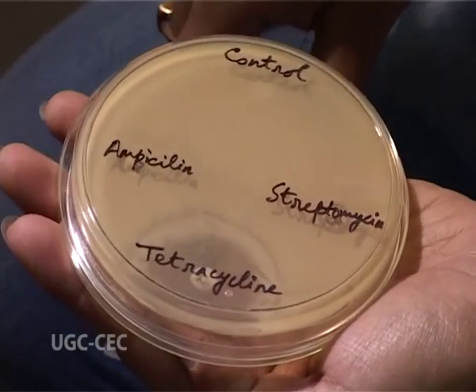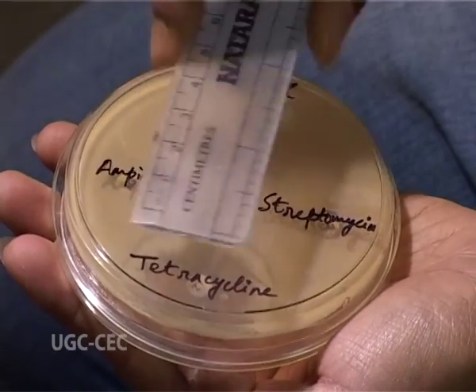On the basis of the inhibition zone, bacteria can be classified as susceptible, intermediate and resistant, following the famous Clinical and Laboratory Standards Institute method, or CLSI method. But there are certain precautions for this particular test or experiment. Number one, the antibiotic disc should be placed tightly on the petri plate. All the glassware and the media used should be properly autoclaved so there is no contamination.